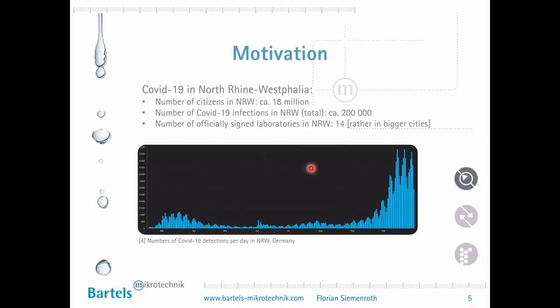But at first, I would like to play a quick intellectual game with you. When we decided to give that lecture in January, the whole COVID-19 situation wasn't real at that point, actually. But we already had in our minds that combining micropumps with microfluidic chips should have an impact. It's necessary to bring that to point of care diagnostics, for example.